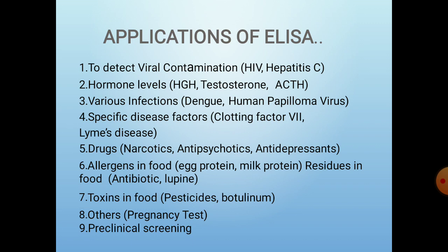It helps to find allergens in food like egg protein, milk protein, residues in food, antibiotics. It helps to find toxins in foods, and also helps in other tests like pregnancy test and preclinical screening.